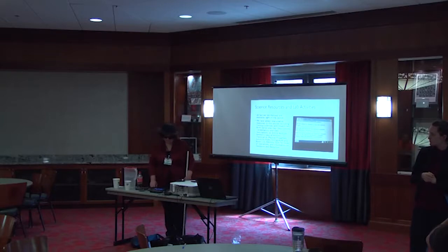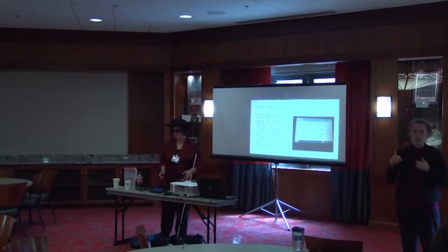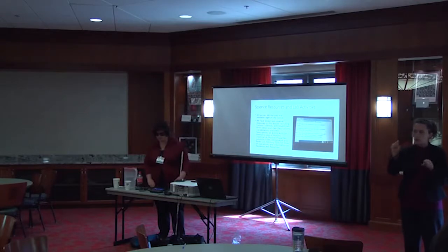And then that was just asking the same thing again. Do you want to change LabQuest to English? Yes or no? Sci-Voice Talking LabQuest version 2. Starting LabQuest application. Please wait. LabQuest application. Sensor page. Details box. Data, connections, additional features, and CH1. Temperature 21.9 degrees Celsius.